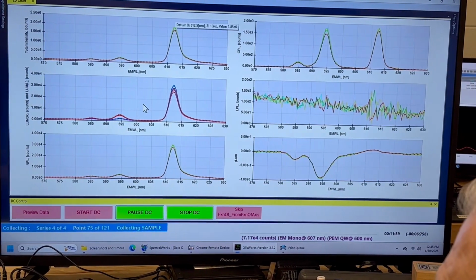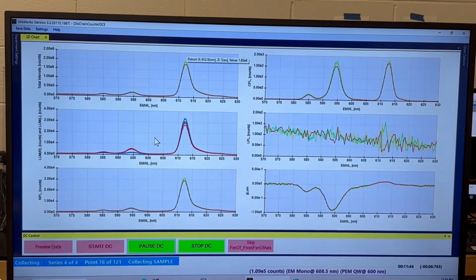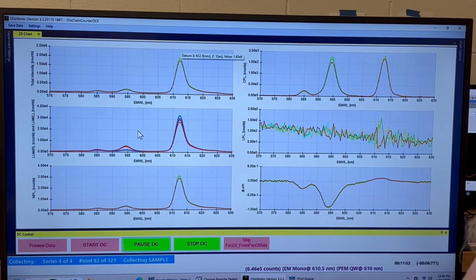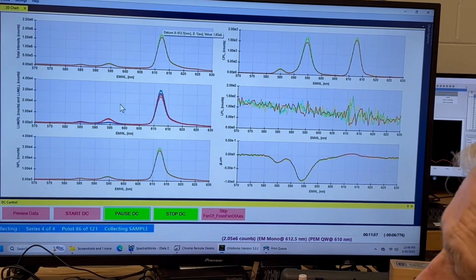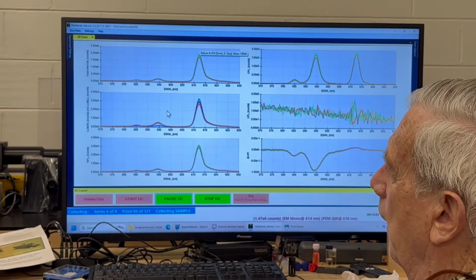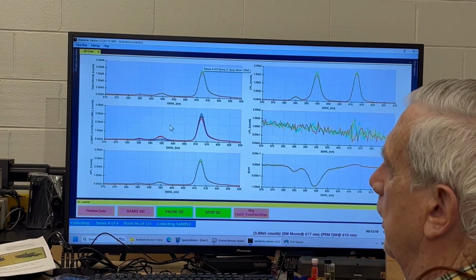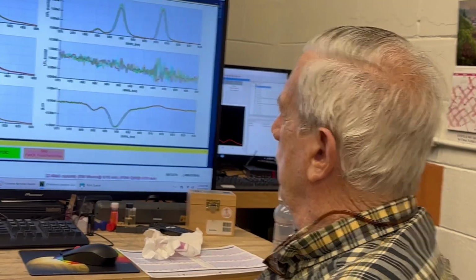In this case, the sample is a total of about 0.9 milliliters in a 4 by 4 millimeter square quartz cuvette. I've demonstrated to myself a couple hours ago that if I raise the cuvette a centimeter or so in the cuvette holder, I get the same data, and that would allow me to put only 0.5 milliliter in the cuvette. Very economical sample, which is rather nice.